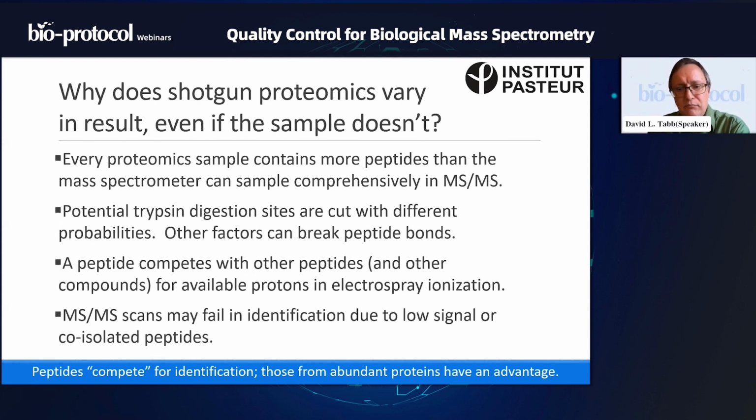Every peptide must compete with every other peptide as it comes out of the column for the available protons when we are using electrospray. So something like ion suppression can occur, where a peptide ion is not visible in one run but is in another, because of other peptides that are outcompeting it for the protons that are available. If it doesn't make an ion, mass spectrometry can't see it.